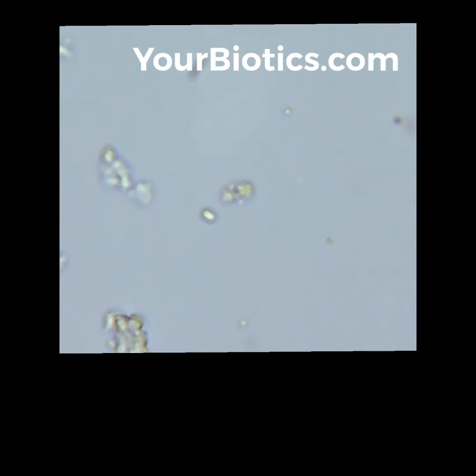Freeze-dried kills cells, and I will show you definitive proof of that. I'll let it run a little bit longer so you can get a general idea of what happens in the microbial world, and then we'll take a closer look.